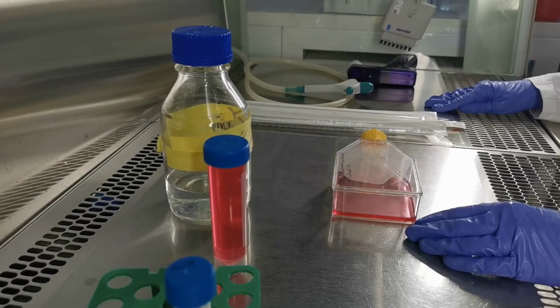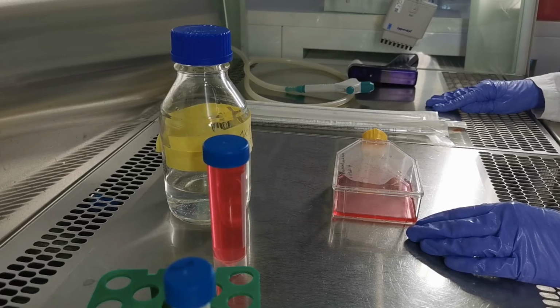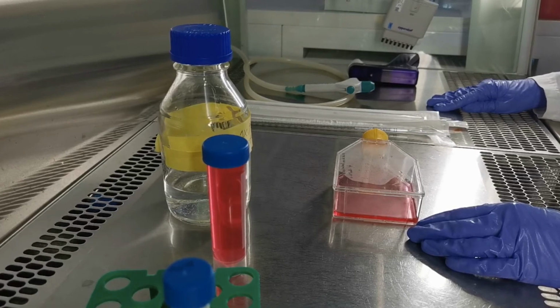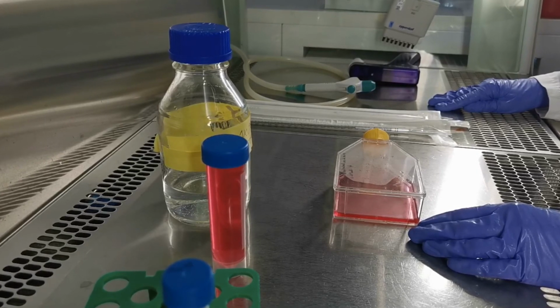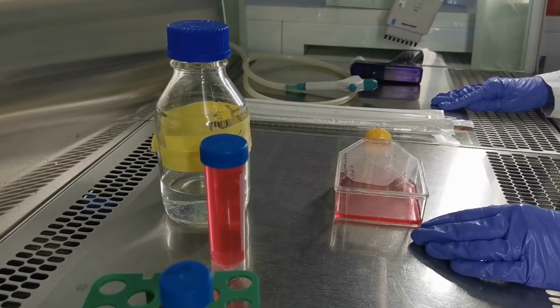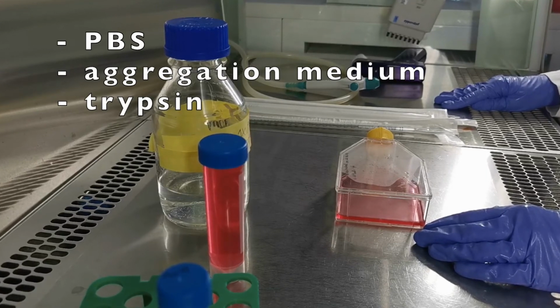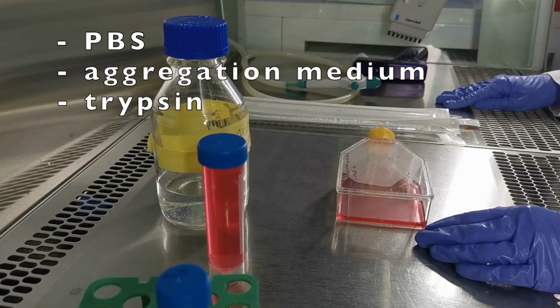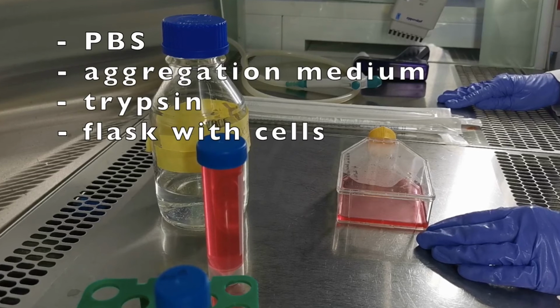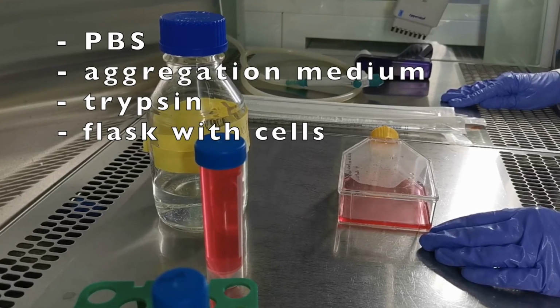Now we will proceed to the generation of microtissues. All steps will be performed under a sterile cell culture hood. Ensure the hood is clean by spraying it with 70% ethanol. Bring all of the items that you need, so PBS, medium and trypsin, and spray them with ethanol prior to transferring them under the hood. You will also need to bring your flask of cells. These do not need to be sprayed with ethanol prior to bringing them into the hood.